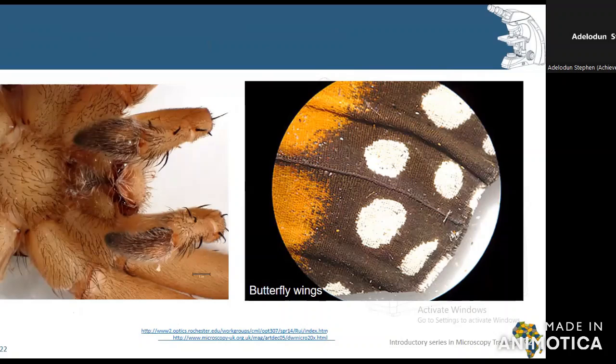It is a feature that is so unique to stereomicroscopy. These images can be stacked together to form a single image which is focused in all the planes. And this is a term that is known as Z stacking in microscopy.